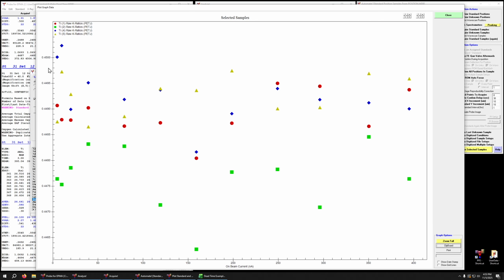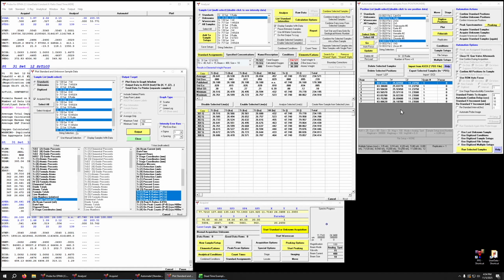So we now are going, what is this, 4 or even 3 in the third decimal. So well under a percent variation from essentially 5 nanoamps all the way up to 400 nanoamps. So we've got a couple of orders of magnitude of count rate changes across this and very little variation. So that's pretty good. Our dead times are in pretty good shape. So let's close this out.